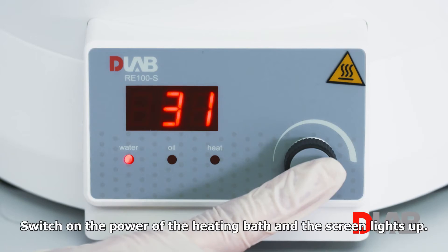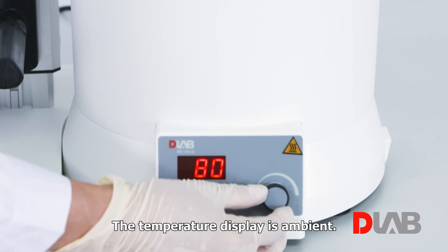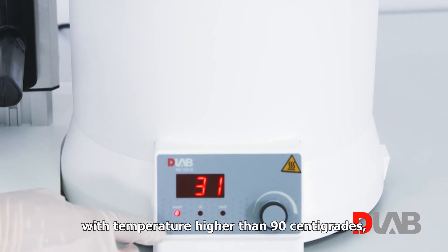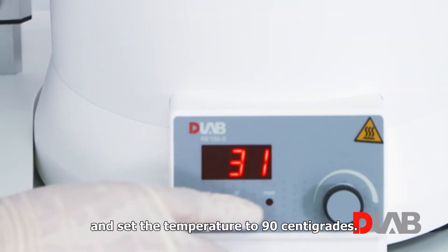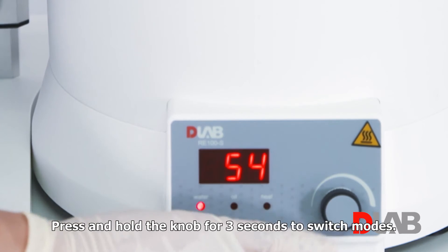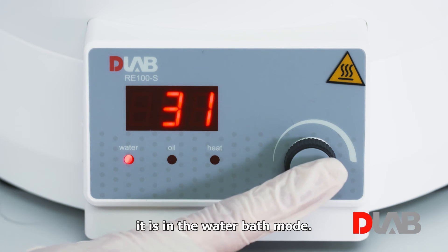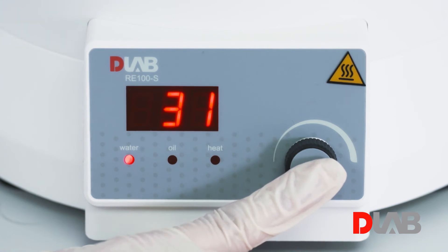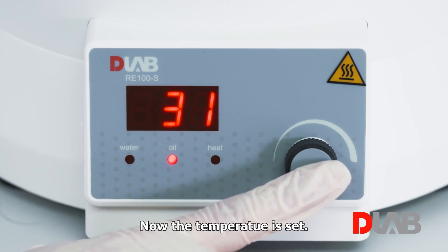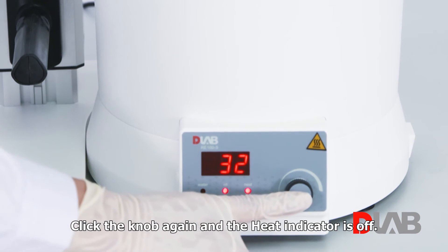Switch on the power of the heating bath and the screen lights up. The water indicator lights up as the default is water bath mode. The temperature display shows ambient temperature and the target temperature is set to the latest value. If the previous session used oil bath at a temperature higher than 90°C, it will switch to water bath and set the temperature to 90°C. Rotate the knob to change the target temperature. Press and hold the knob for 3 seconds to switch modes — when H₂O is on screen with the water indicator on, it is in water bath mode; when Oil is on screen with the oil indicator on, it is in oil bath mode. Click the knob to start heating; click again to stop.